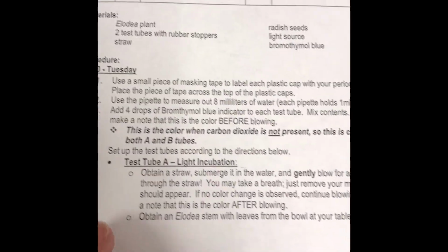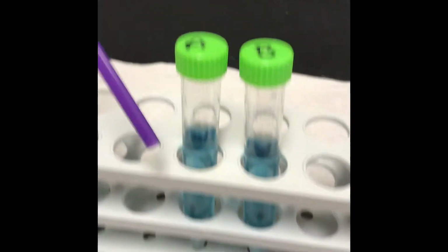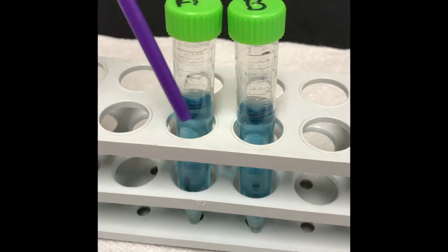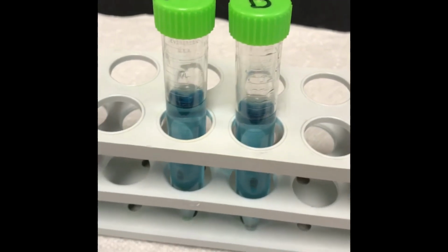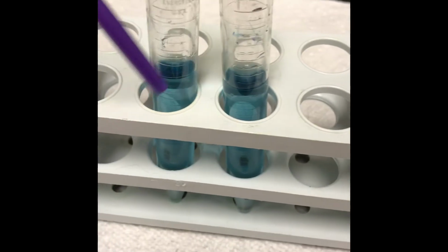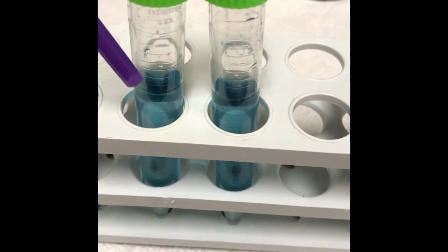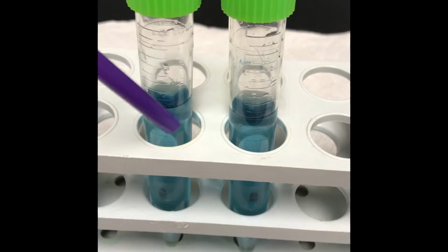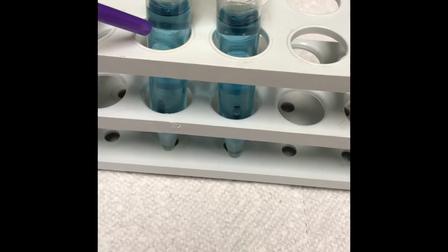To tube A, as you can see in the directions, I'm going to use a straw. There's my straw. And very carefully, I'm going to submerge it into the tube like this, and then I'm going to blow carefully bubbles so that my breath, the carbon dioxide, comes into contact with the bromothymol blue. And the point is, what I'm trying to do is let the acid from my breath change the color of the bromothymol blue. I want to change it to a green or a yellow color so that I then will have the presence of carbon dioxide in my tube.